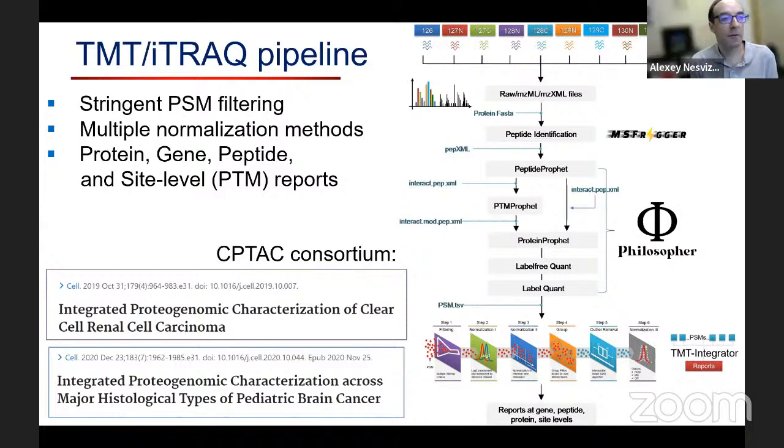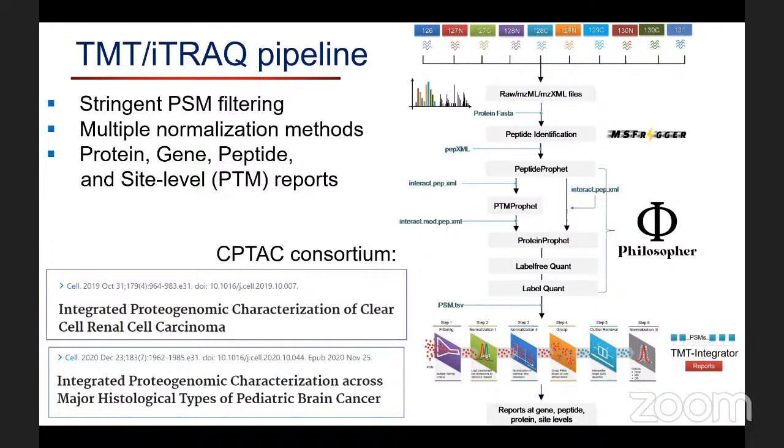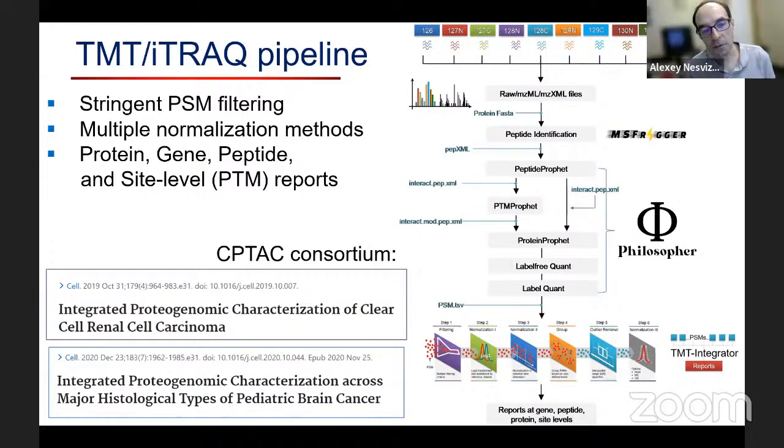Well, the difference with MaxQuant, of course, is that the low-abundance proteins, the proteins that are quantified by a lower number of ions, are where you gain the most. Because if you have more, tools like IonQuant can be run with MSstats, for example, too, and MSstats will model peptides.